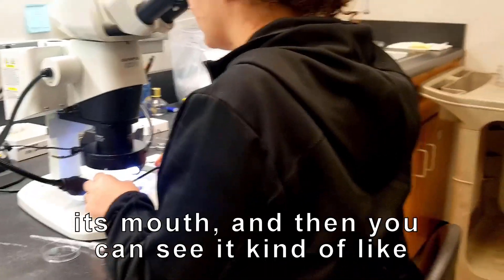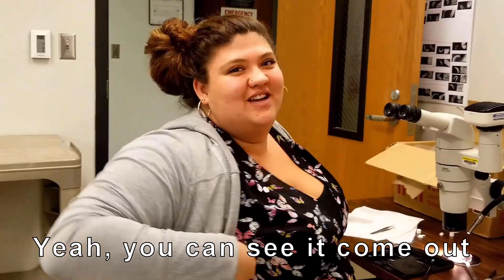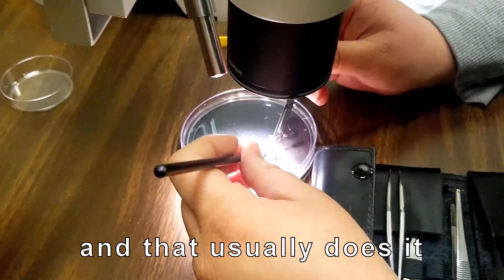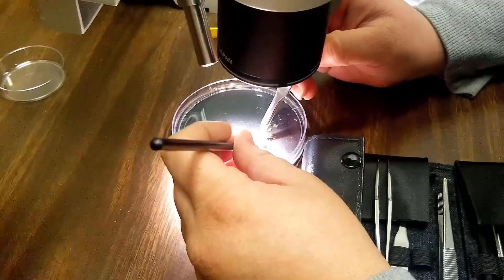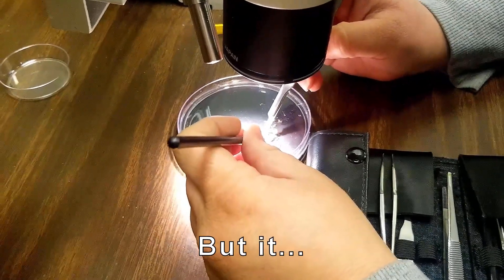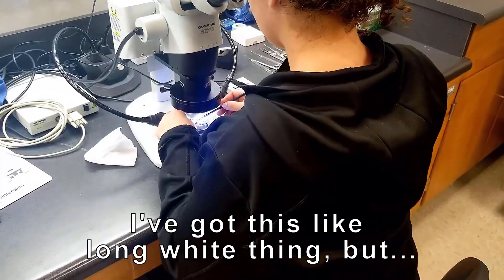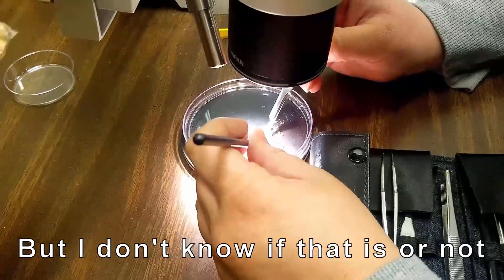But it's basically like its mouth and then you can see it kind of, it looks like, you can see it come out. Yeah, okay. Yeah, I have something and I don't know what it is, but yeah, I thought that was the radula.